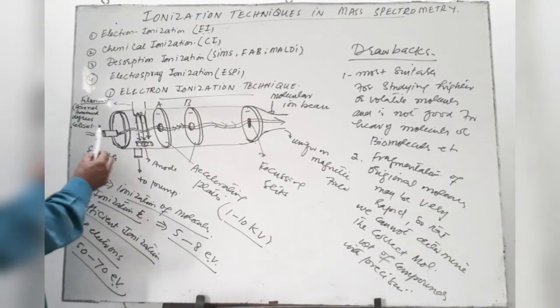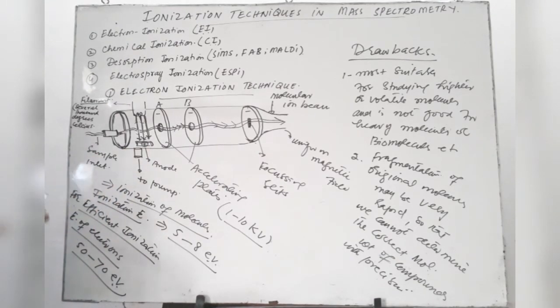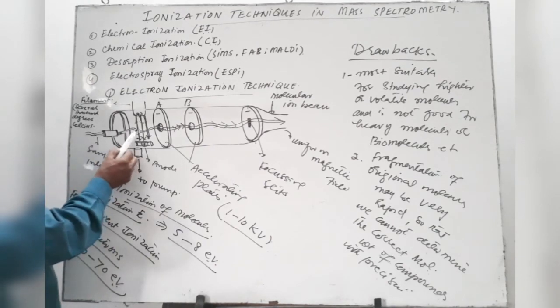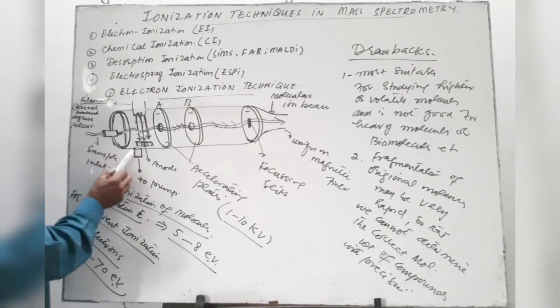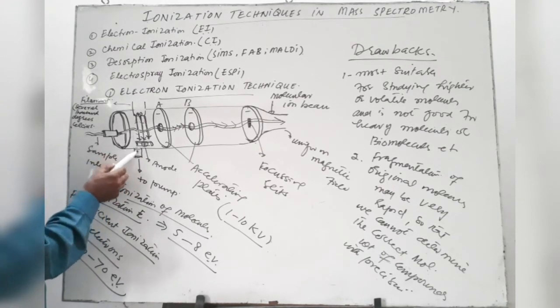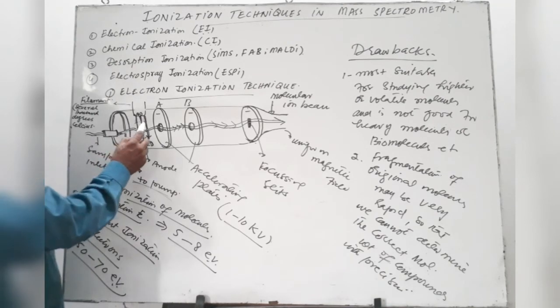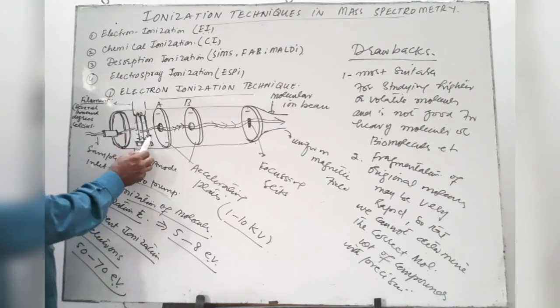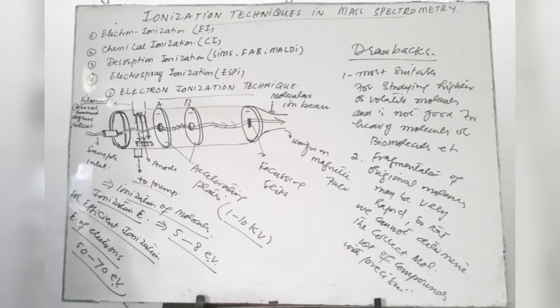During this process of ionization, some of the molecules get ionized, but most of the molecules remain unionized. These unionized molecules are constantly taken out by means of the vacuum pump. There is another possibility that the electrons produced by the ionization of molecules may be caught by other molecules, and we may also get negatively charged ions, or molecular anions.